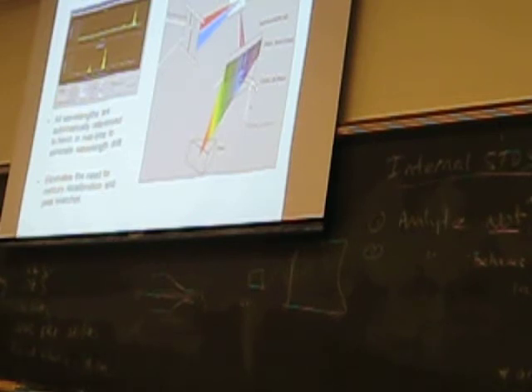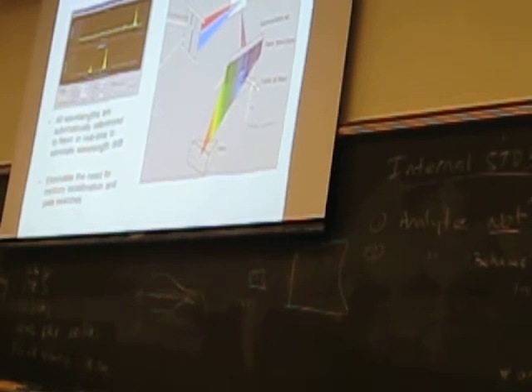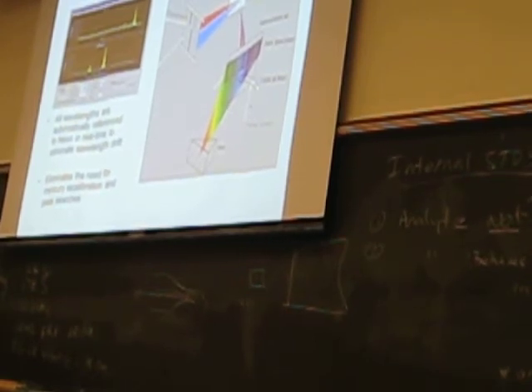Well, the OES and these kinds of instruments are a notch a little bit above that, and what makes this complicated, and the reason I discourage people from using the ICP-MS spectrometer is that it's even more complicated. It's impossible for somebody to walk in with samples and spend even an hour to get to the point of doing the measurements because of all the different things that have to be dialed in.